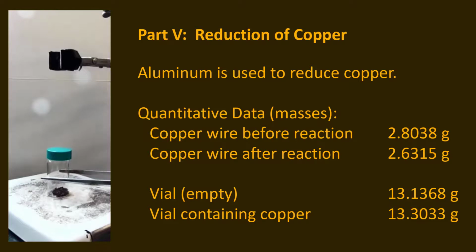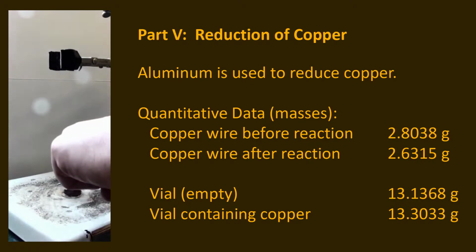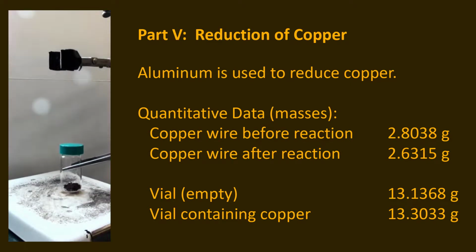thing is now hot enough. And so we're at this delicate balance where what we want to do is get rid of these vapors that are in there, which requires us to sit this on a really hot surface for a second.